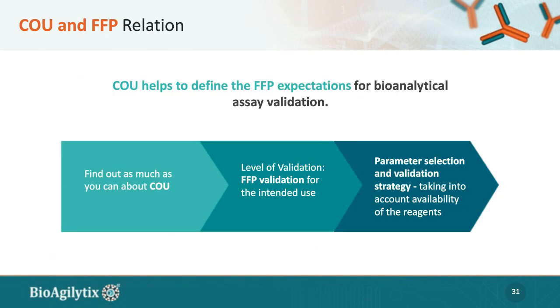So once you have the context of use, and you know through that what is the required sensitivity, the type of samples you're going to get, you may even have some information during that time around the pre versus post dose changes you may see. Is the level of drug going to be high, and do we need to look at the drug interaction potentially with the biomarker that you're measuring? A lot of factors that you can learn during the COU. At that point, you come up with your fit for purpose validation.